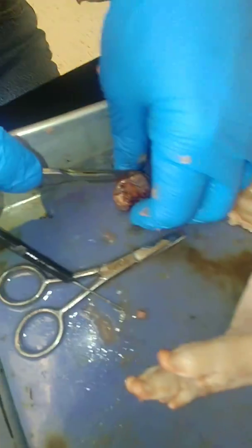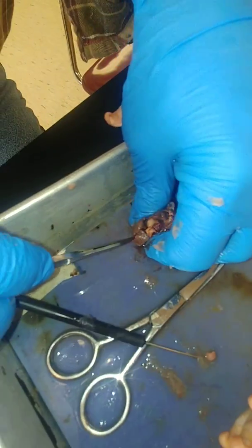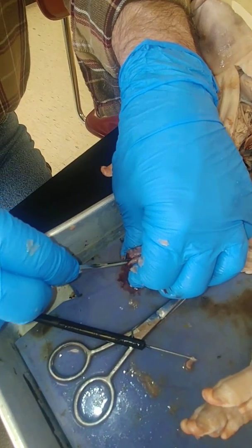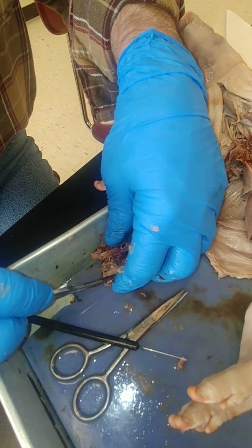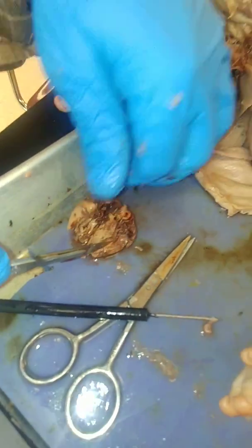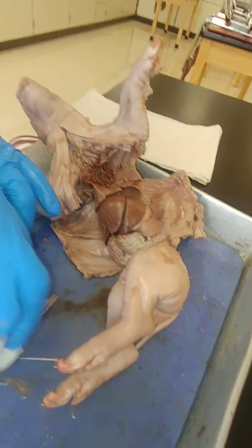Now if we cut this open, and we'll try to slice down through the middle of things. We'll show you a few structures on the inside of the heart here. Hopefully things will be fairly clear. Let's take some paper towel here and kind of dry this out.